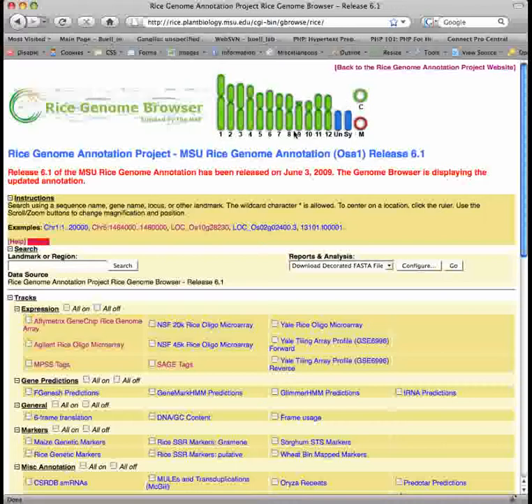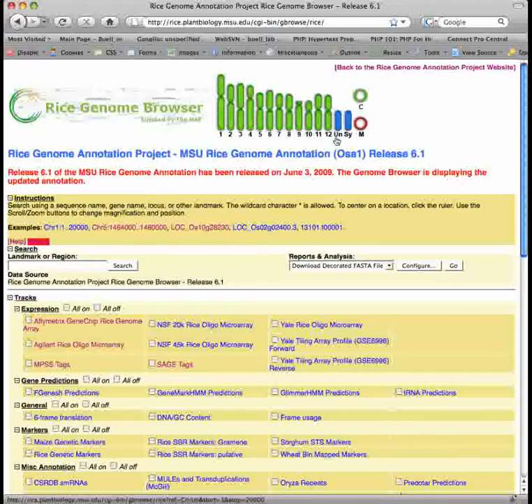There are the official 12 chromosomes in green, labeled 1 through 12, the mitochondrion — the red circle — and the chloroplast genomes — the green circle. We have also created two artificial pseudomolecules. The unanchored (UN) and the Syngenta (SY) pseudomolecules are shown in blue.